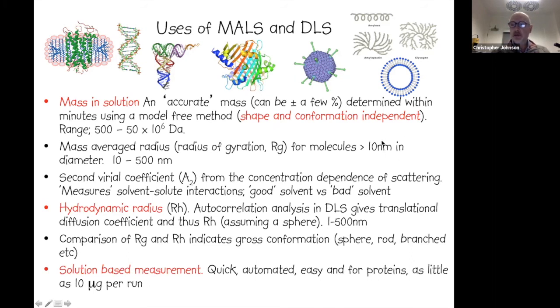If you're interested in playing around with that, then a really cool thing to do is to get a little bit of milk and put it into water. That forms a kind of an emulsion of lots of small particles. And that's a good way of visualizing where light beams are going, because it generates a highly scattering solution. So for example, if you come to a spectrometer and you want to visualize how the light is being focused and where it's going within the instrument, you can do that by putting in a sample which has heavy scattering. You'll be able to visualize the beam.